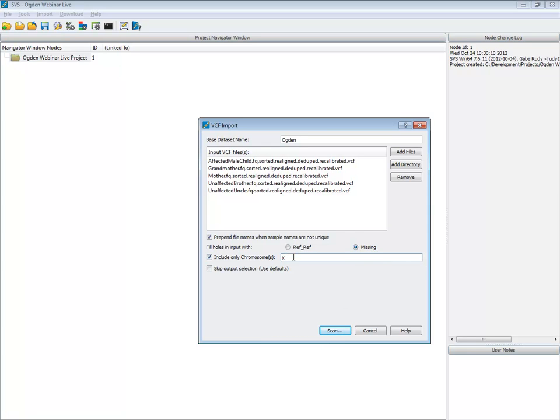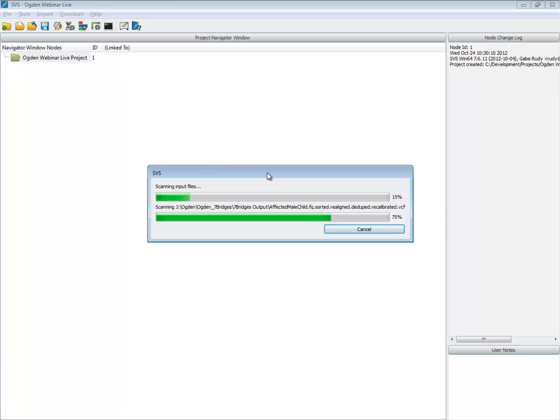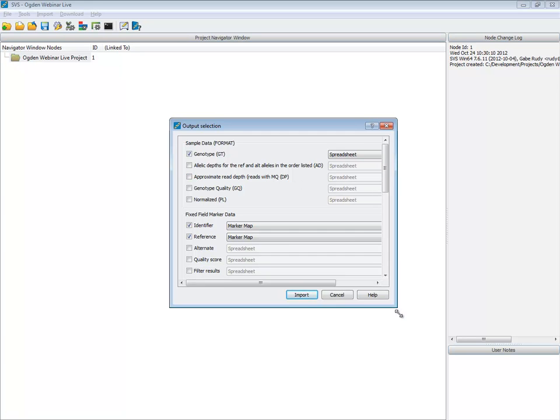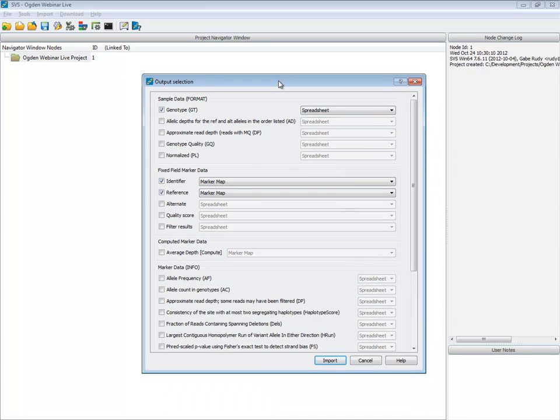The other thing is, this is an X chromosome capture. Let's go ahead and only import data that's in the X chromosome. You would expect to see some variants scattered across the autosomal regions. That's simply because there are regions that have high similarity between the X chromosome and other parts of the genome, and other problematic or systematic biases of both the exon capture kit and the sequencing.